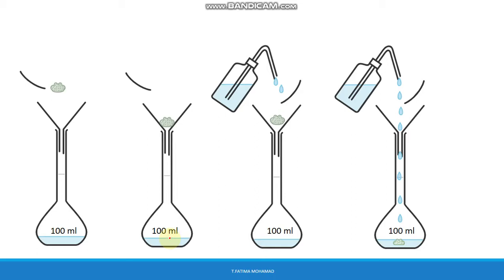We should use distilled water in preparing solutions — distilled water means water without ions. We transfer the solid through a funnel into a volumetric flask containing a few milliliters of distilled water. Then we use a wash bottle to rinse the funnel and the watch glass to collect any extra solute remaining on them, and all the distilled water goes down into the volumetric flask.